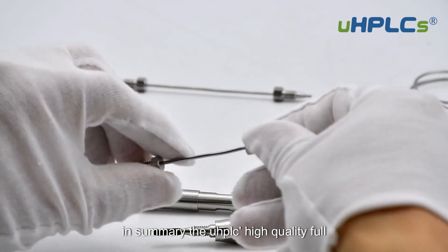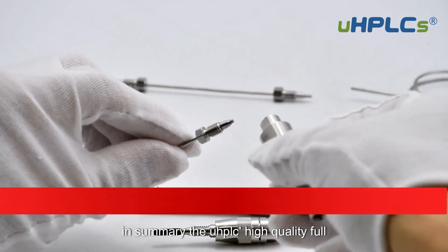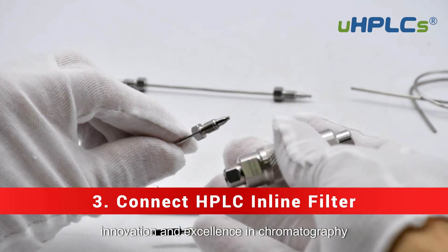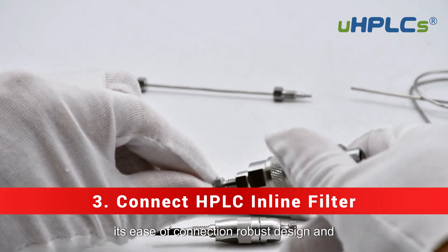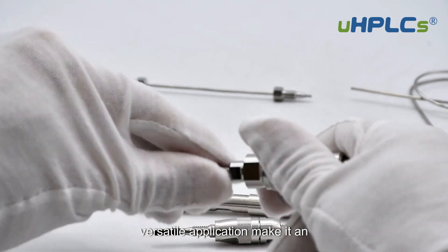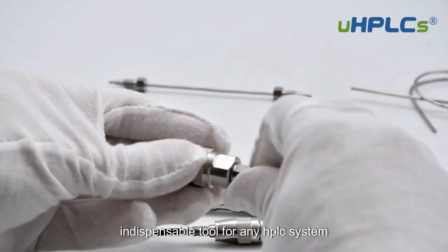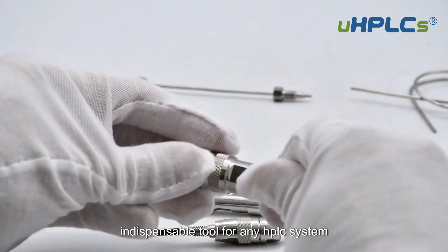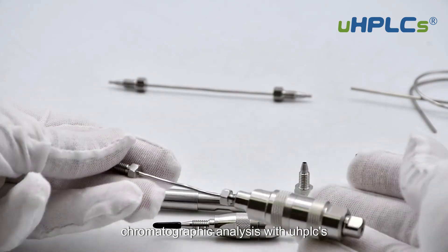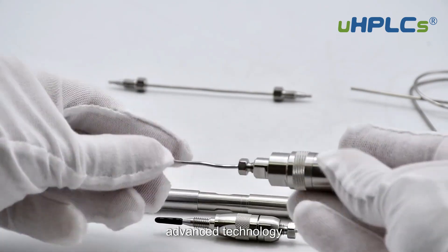In summary, the UHPLC High Quality Full Series HPLC Sample Loop is a testament to innovation and excellence in chromatography. Its ease of connection, robust design, and versatile application make it an indispensable tool for any HPLC system. Experience the difference in your chromatographic analysis with UHPLC's advanced technology.